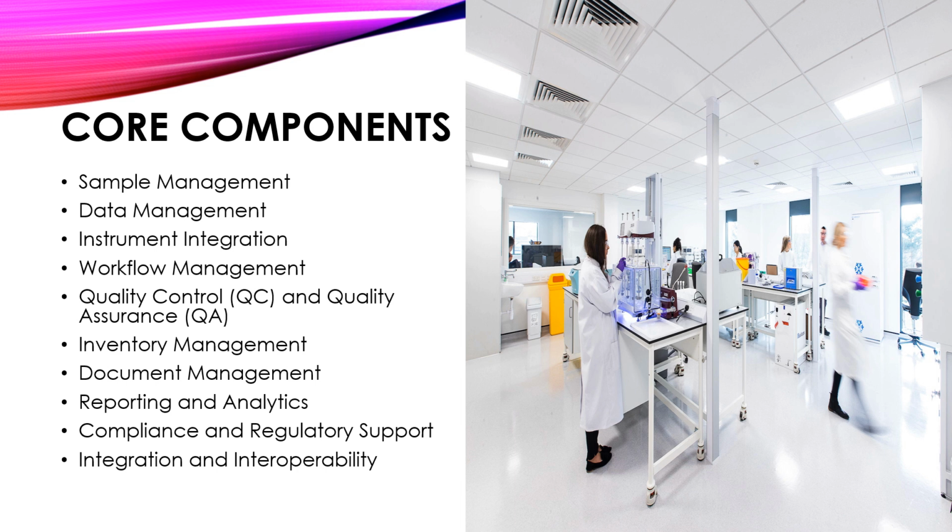Inventory management. A laboratory management system tracks laboratory supplies, reagents, and consumable inventory levels, automates reordering processes, and ensures the availability of necessary resources for uninterrupted laboratory operations.